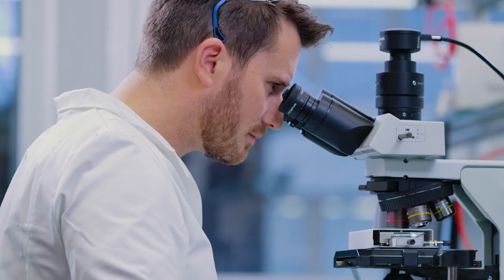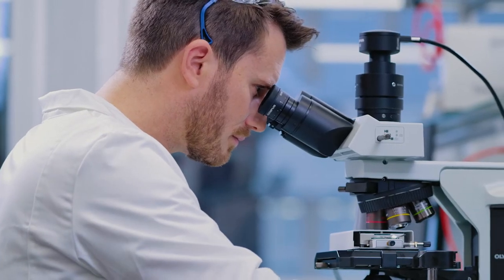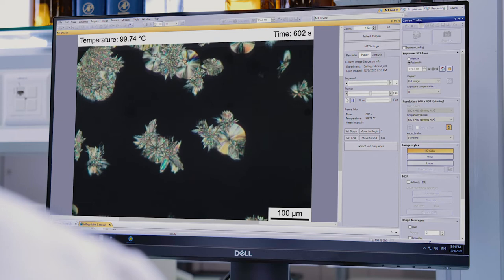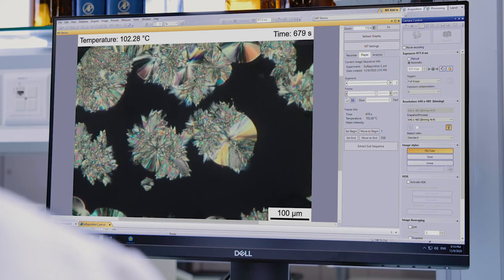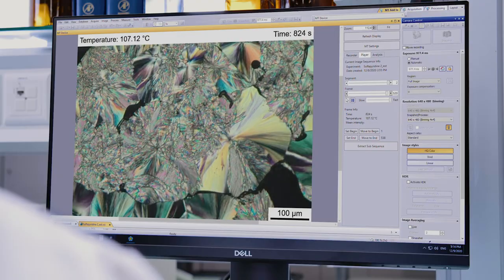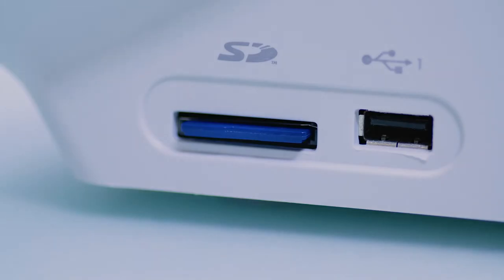The optional professional imaging package includes a state of the art camera and software. It allows manual or automatic recording of pictures and movies including overlay with temperature readout. Professional and versatile documentation supports every workflow.